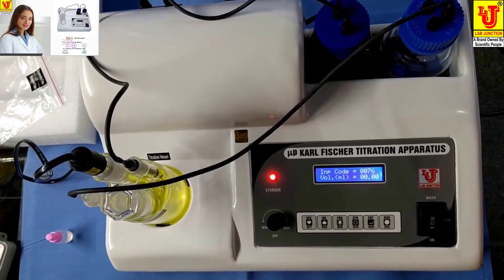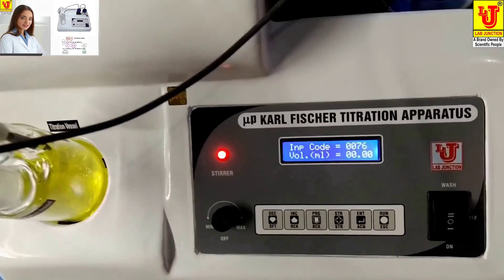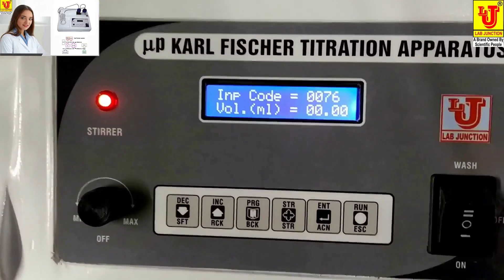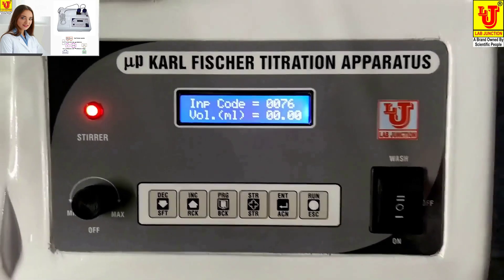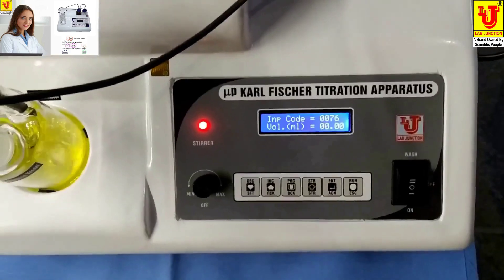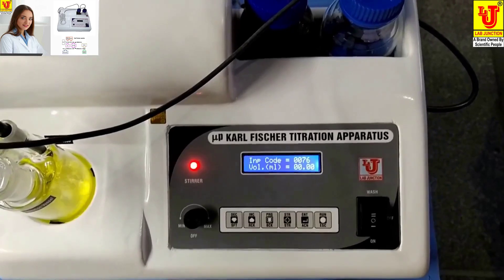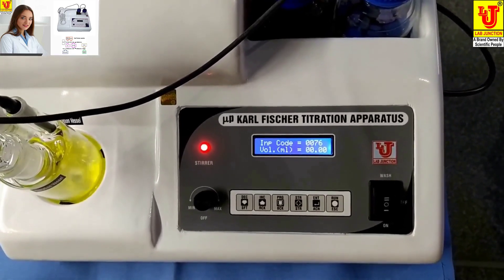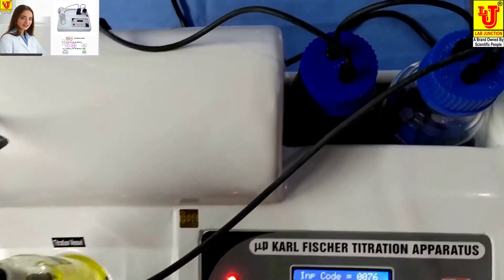Lab Junction Microprocessor Karl Fischer Titration, Operators Model LZ17601. With this instrument, we will cover the Karl Fischer Titration Operators guide.